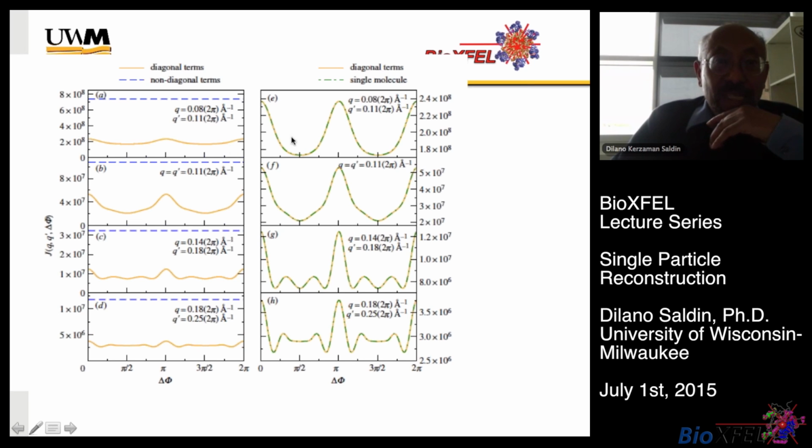And what is more, we found that the single particle signal becomes almost the same as the multi-particle signal. I think Rick Kirian has also written a program that demonstrates this, if you average over enough diffraction patterns, and this holds whether or not you assume coherent scattering.